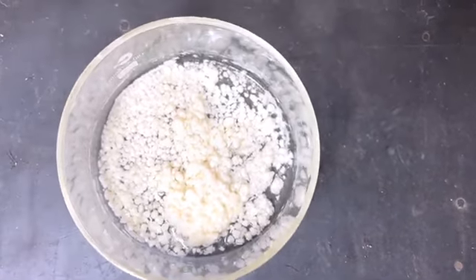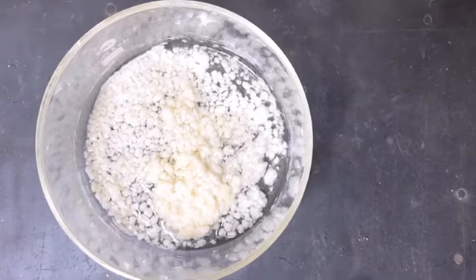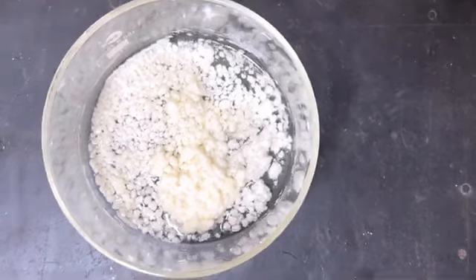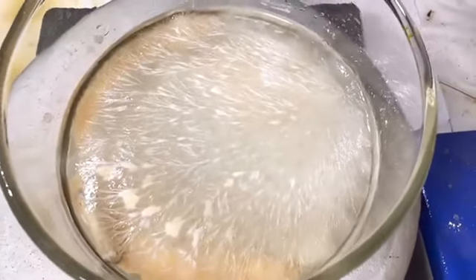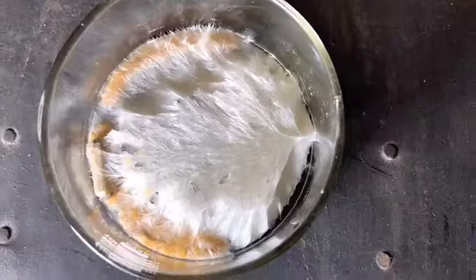This time I let the crystallizing dish slowly cool down by insulating the dish with aluminium foil. When it was cooled slowly, beautiful needle-like branching crystals were formed. It was later vacuum filtered and dried.